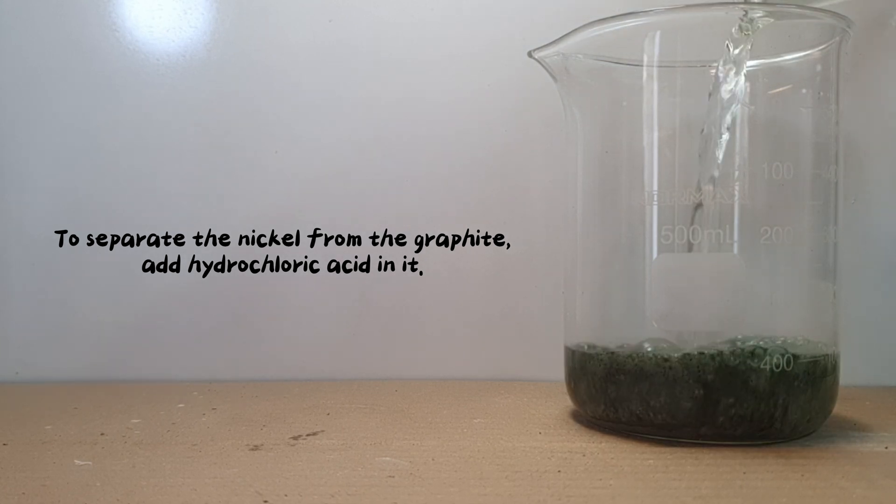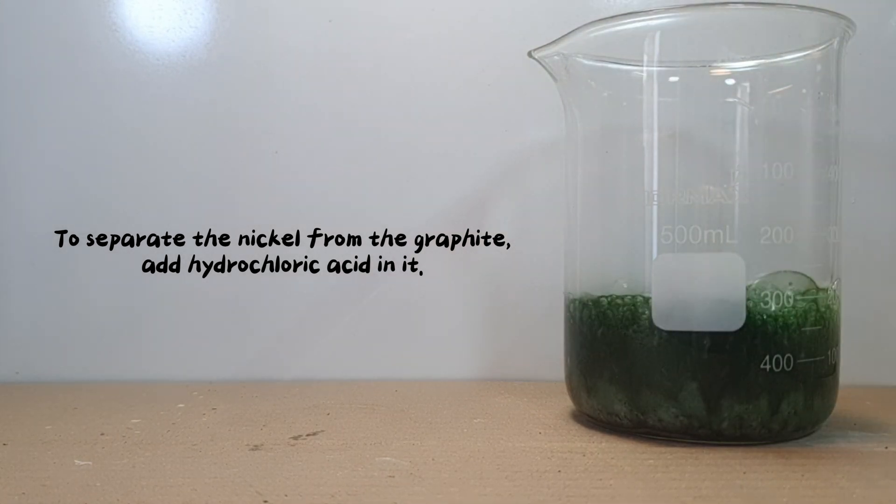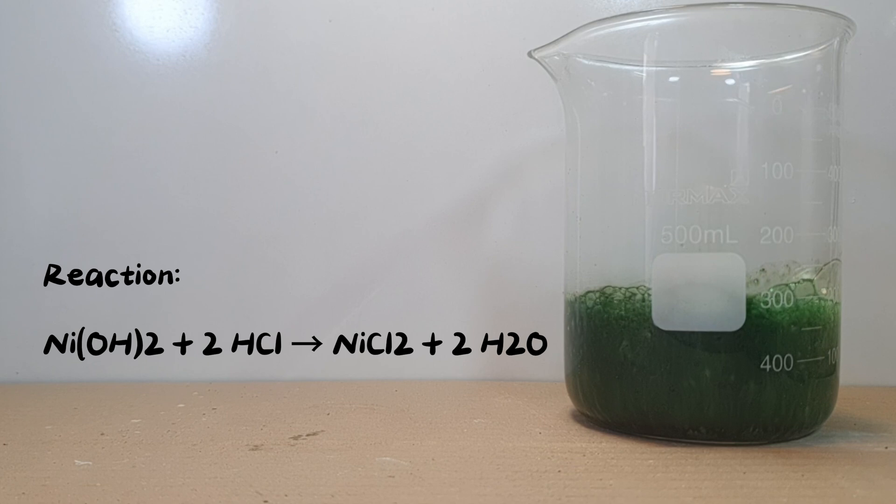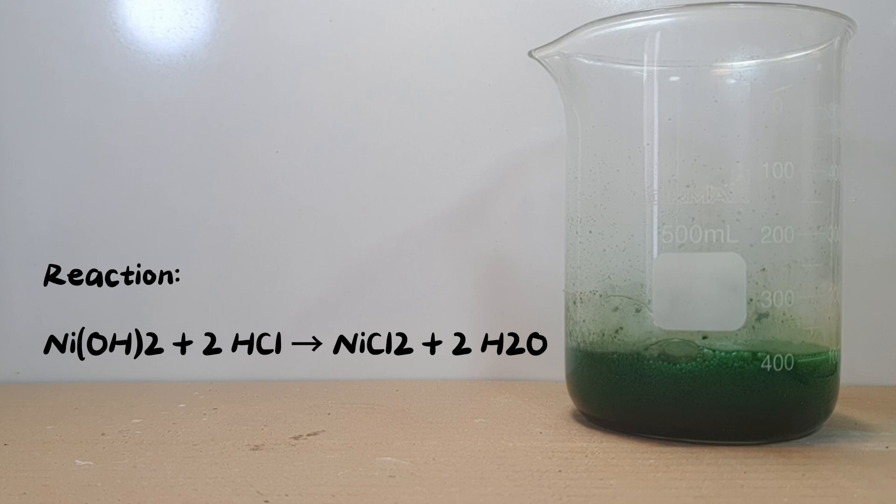To separate the nickel from the graphite, add hydrochloric acid in it. Nickel hydroxide reacts with hydrochloric acid to form nickel chloride and water, while graphite does not react with the acid and remains unchanged. This allows the separation of nickel from graphite.